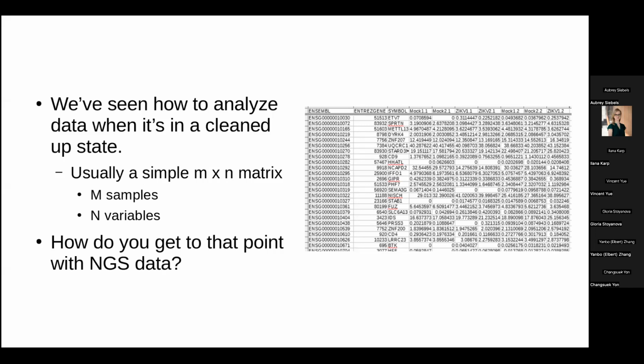This first slide is just generally when you have data that's in a very easy to use format. I hope that we all know how to work with this. Generally you have a spreadsheet, or a text file that has a matrix of all your count data. Once it's in this form, it's straightforward to do the analysis. It's getting to this part that takes the most amount of time, that takes all the processing. And that's what we're going over during this presentation.